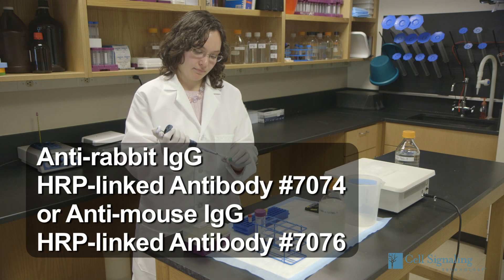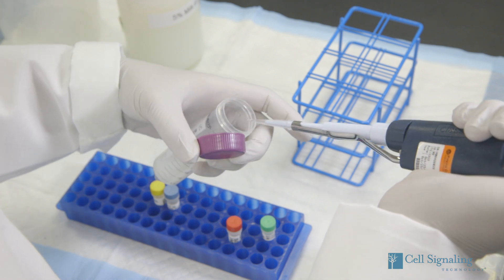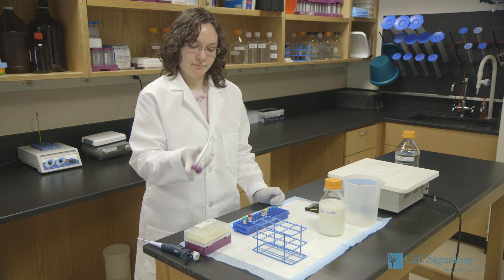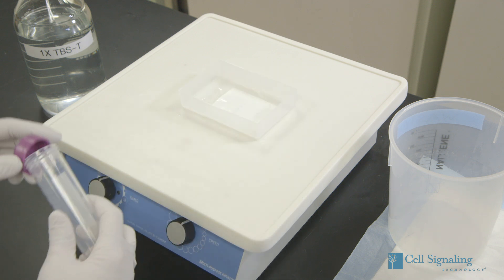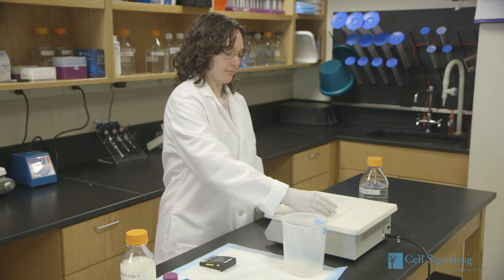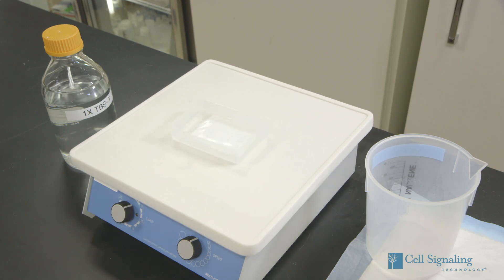After the washes, dilute the species-appropriate HRP-conjugated secondary antibody at 1 to 2,000 in 10 milliliters of blocking buffer. Anti-biotin HRP-linked antibody can also be added to the 10 milliliters of blocking buffer to detect the biotinylated protein markers. Incubate the membrane in the diluted secondary antibody solution with gentle agitation for 1 hour at room temperature on an orbital shaker. After the incubation, wash the membrane three times with 15 milliliters of TBST for 5 minutes per wash, then proceed with the protein detection.